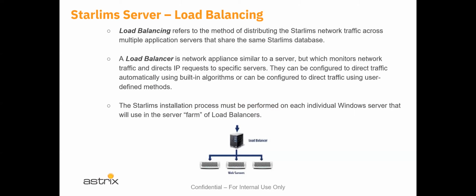And typically a system administrator is used to do that. Again, we typically don't have to do that, but we need to be able to speak their language if they start talking to us about it. So for every specific machine that will be used beneath a load balancer, we must go through the entire STARLIMS installation process.